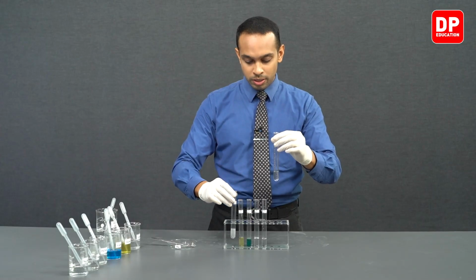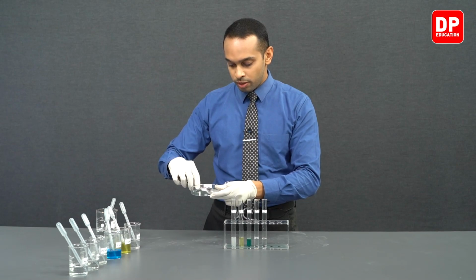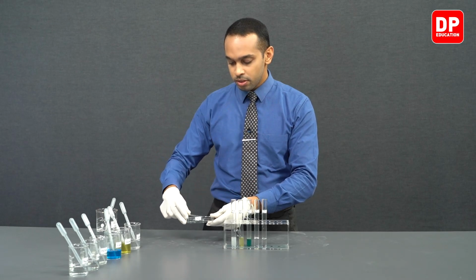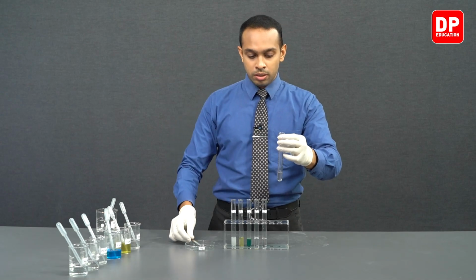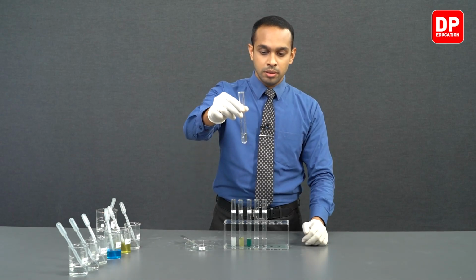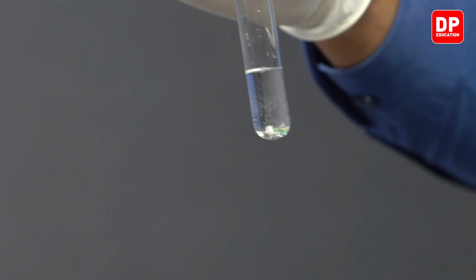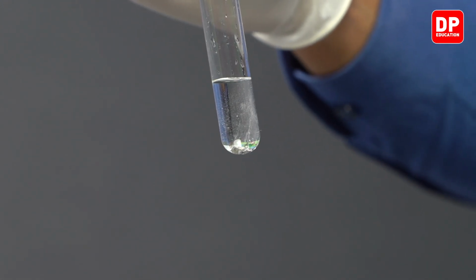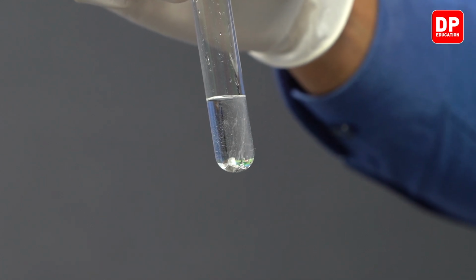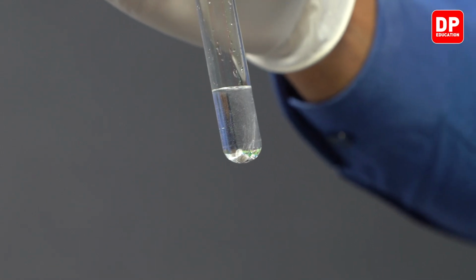I have only added a very small piece of magnesium into our sodium 1 plus aqueous ion solution. We'll add a little bit more. So you can observe, even in sodium 1 plus aqueous ion solution, magnesium shows a reaction. Now this reaction, the bubbling that you observe over here, is due to magnesium reacting with the water in the medium to produce hydrogen gas. So magnesium could react with water and produce hydrogen gas.